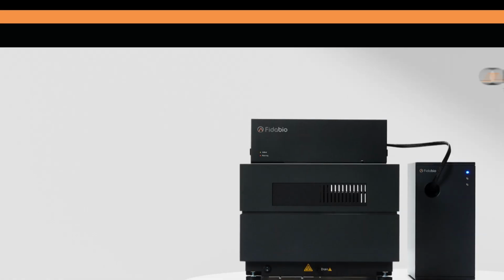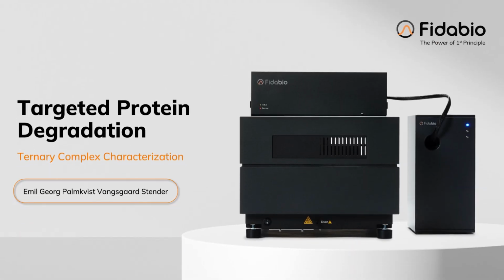Hello everyone, and welcome to this overview of assaying ternary complex formation for targeted protein degradation with your FIDA. In this video, we'll be going through the experimental setup as well as the subsequent data analysis.